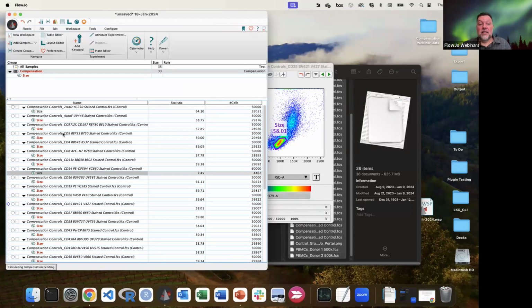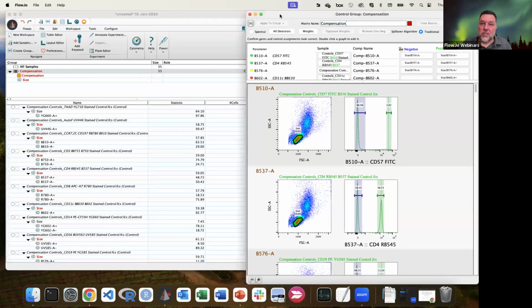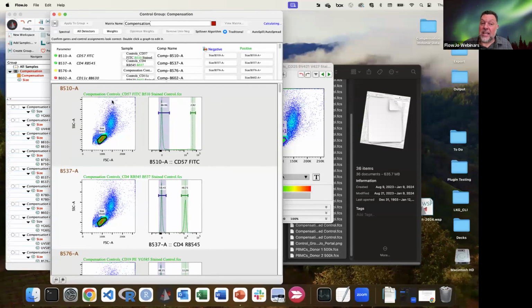And in reality, this is going to take just a minute, but it's got to calculate, it's got to auto gate, it's got to assign these samples to the brightest channel. And it's not going to always get it right because, again, you're now taking every bit of information from the entire spectrum, and these detectors and their filter sets are just side by side.